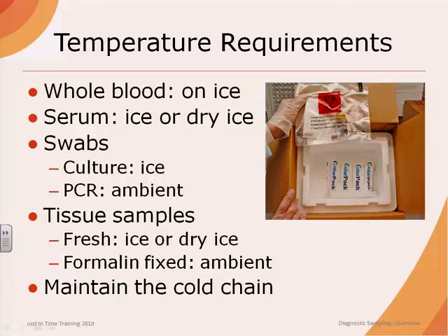This photo shows a sample for submission in a sealed plastic bag to prevent leakage. A cold pack has been placed with the sample to keep it chilled during shipment.